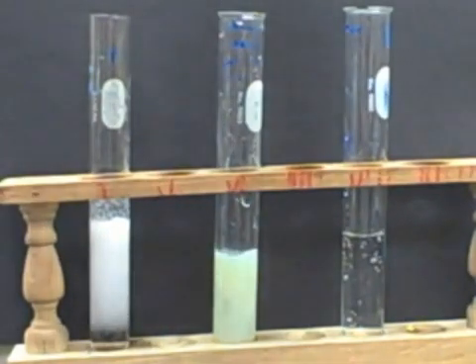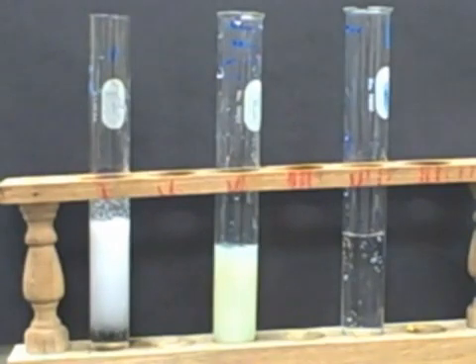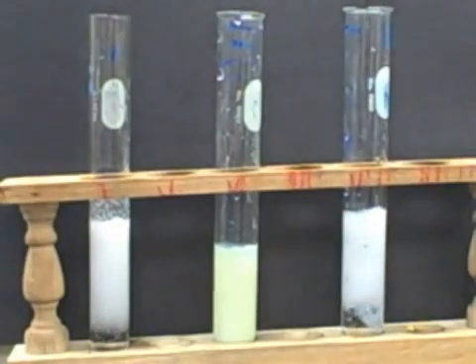Greenish yellow in color. Silver forms some weird compounds. And then this is lead nitrate and sodium chloride. Also a milky white precipitate, a little more bluish if you look closely.